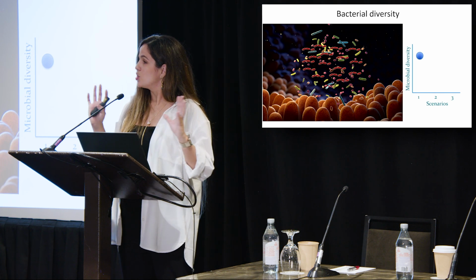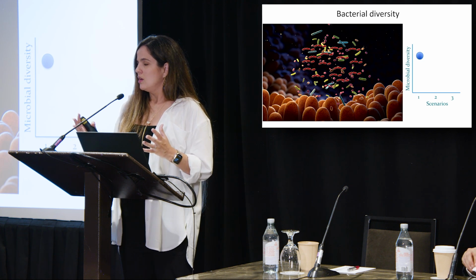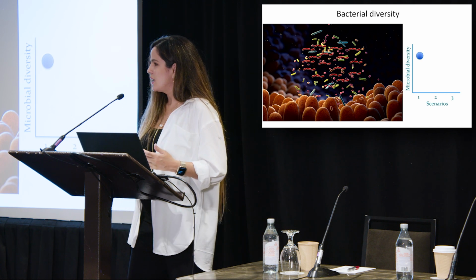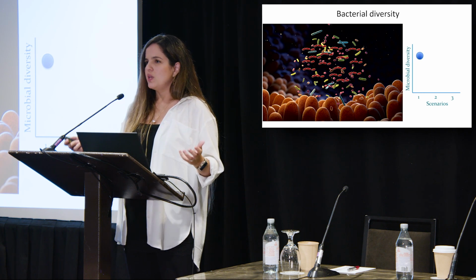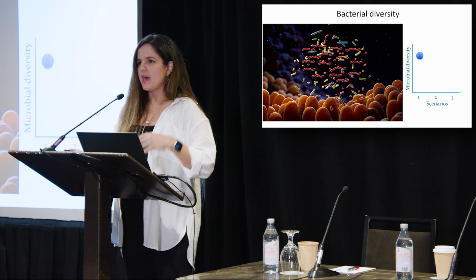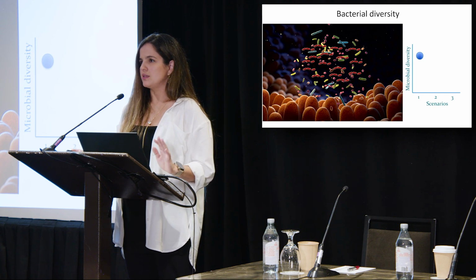Right? So then I will show you a little bit how we do it so you understand a little bit of these terms, because this is something that usually appears in the reports from these companies that provide these microbiome studies in stool samples. So diversity means that after I sequence the DNA, I run all the pipelines to identify this DNA, match them with a database, identify the microbes that are present in a sample.